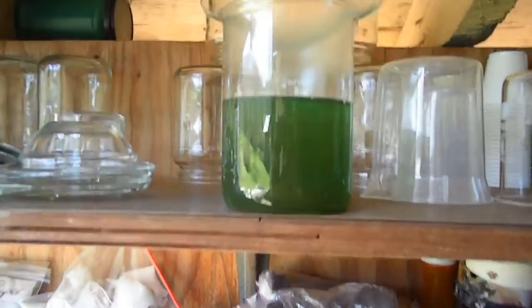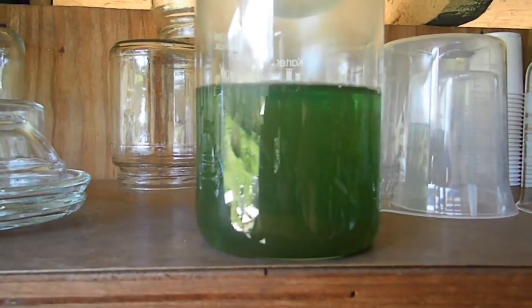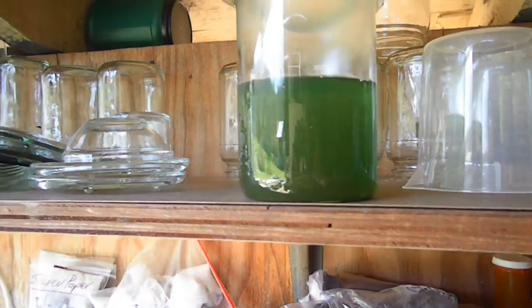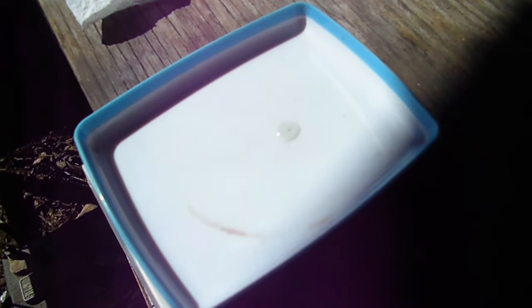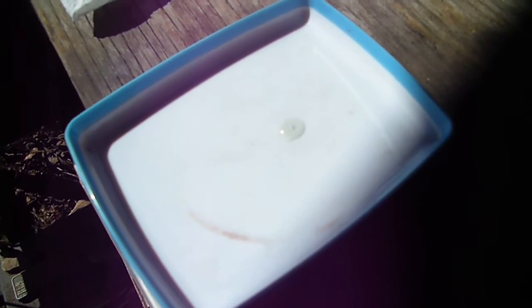Okay, guys, I just wanted to show you, we did get a drop. You can see that little bit of separation in there, so we do have a little bit of gold falling out. I don't believe it's going to be very much. I did another stannous test. You can see right there, after I put in the sodium metabisulfite and let it sit for a minute, I'm not showing anything in the stannous test. It is clear.